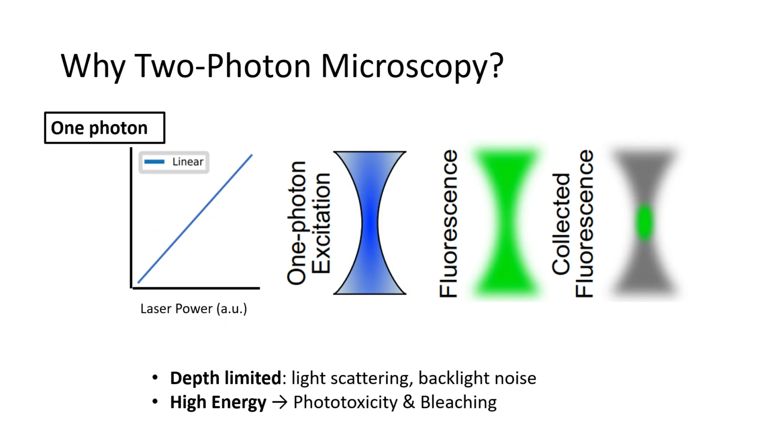So we can first discuss why two-photon microscopy is important. Conventional single-photon fluorescence microscopes lose contrast, resolution, and sample viability once we image deeper than about 100 micrometers, because visible light scatters, excites fluorophores all along its path, and rapidly photobleaches tissue.